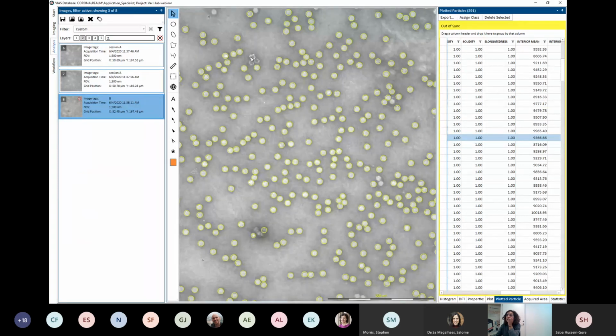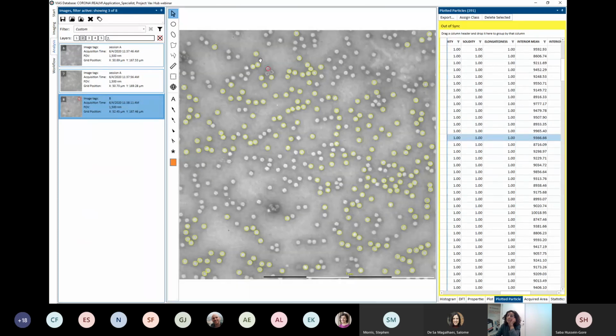And I found this one. I think I don't have clusters in this one, so it detected this one. I think maybe these were more elongated, but you can definitely play around with this, and you can add more features to it as you're moving along.